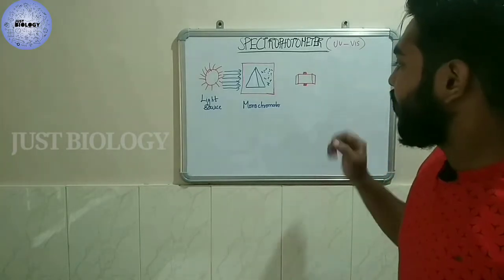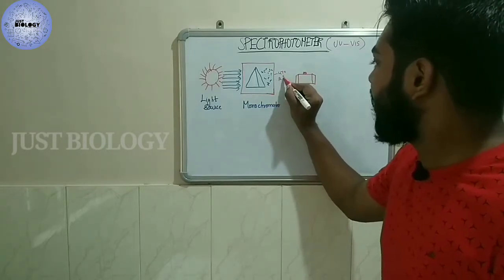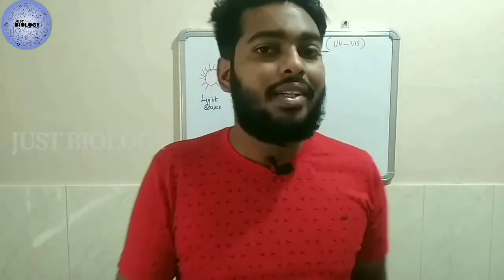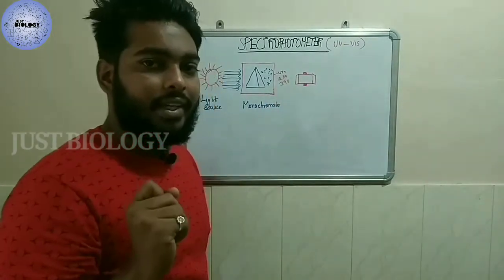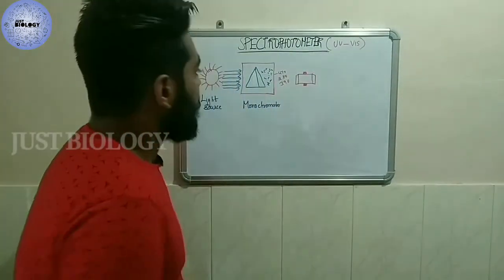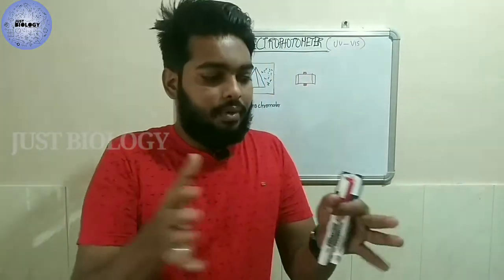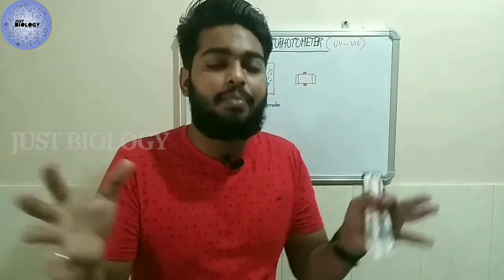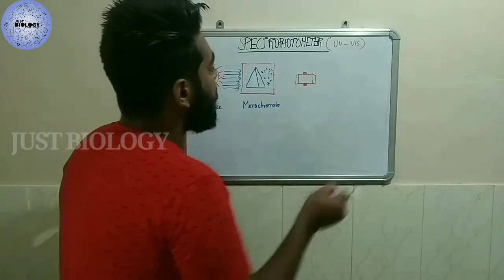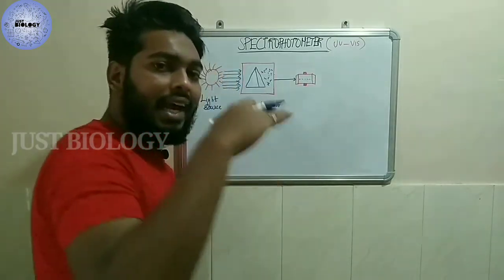Let's say for example, light which comes from this prism is like 470, 280 and 390. Let's imagine these three. It cannot allow all three, it can allow only one light. So not all these wavelengths of light. You got the idea, isn't it? So here is the function of the beam separator. The beam means a cluster of light, a bunch of light rays. So one kind of light ray can pass only through the beam separator. So the beam separator will align the lights.